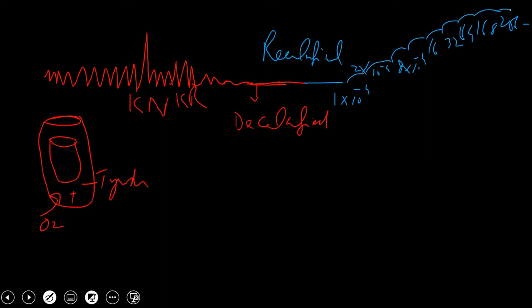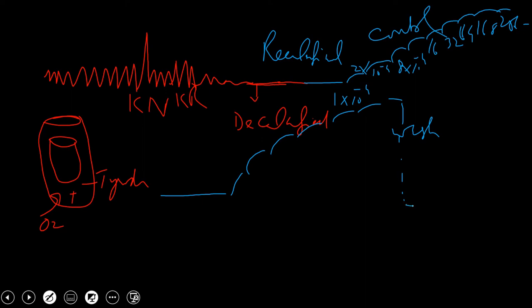So this process is repeated twice. This is a control curve, and this is repeated twice until you get another curve. You see, again decalcified, and you have to recalcify it like this one again. And now you will perform a wash, and once you wash it, you will again carry normal.